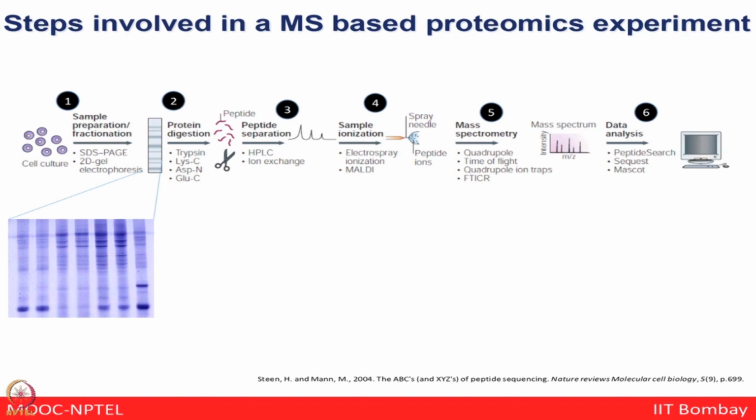Let us walk through the procedure and steps involved as described in this article, but some of these steps we have shown from our data set. So, let us say you have done the protein extraction from a cell culture or the tissue, and now you want to further separate those directly. Either you can use the in gel digestion or use the in solution digestion. That is shown in the first circle here.